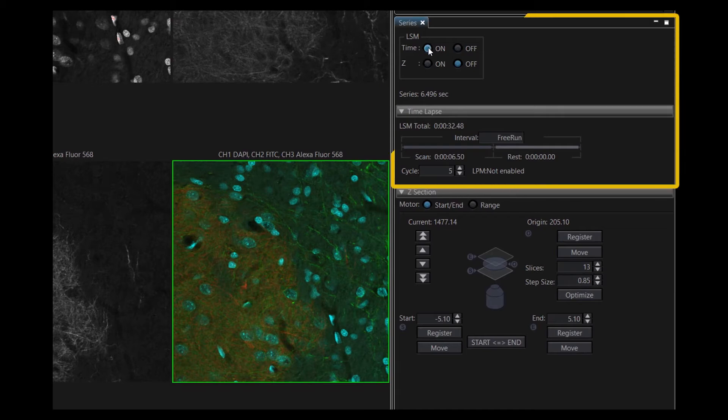Set up your acquisition parameters for time and Z positions as needed. When setting up your time series, take note of the rest time, which is the interval time minus the acquisition time. The rest time needs to be 32 seconds or longer for the TrueFocus module to function properly in single-shot mode during time-lapse imaging.